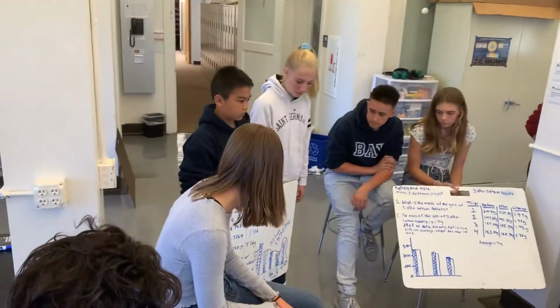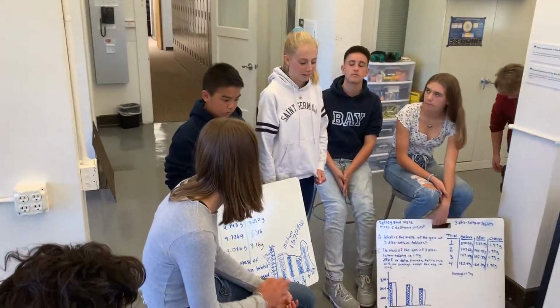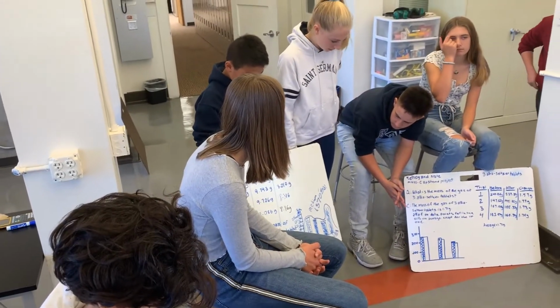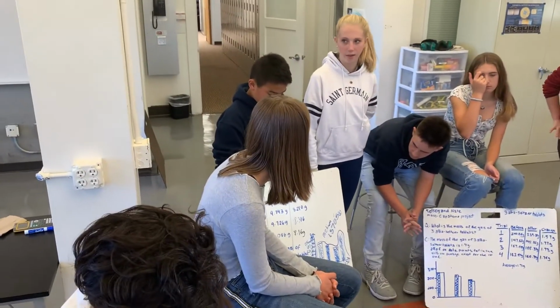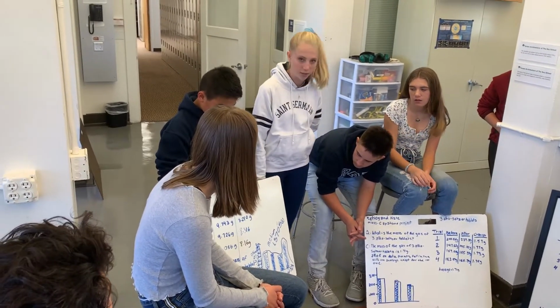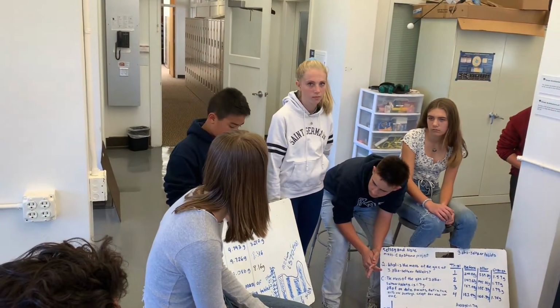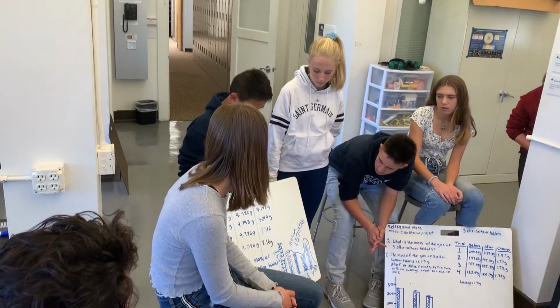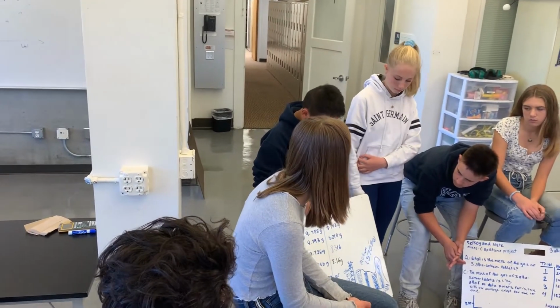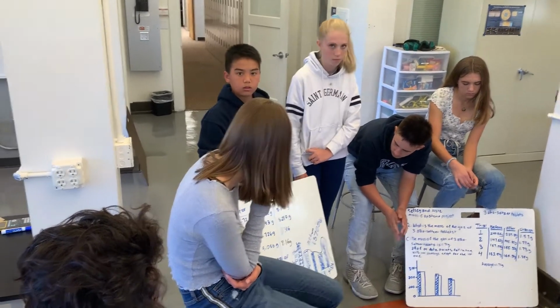So we also did 3 tablets. Originally we were going to do a different strategy with a balloon. It didn't end up going well, so we scratched that and did the regular way. We found that the average mass by 3 Alka-Seltzer tablets is 8.507 grams. We made a graph of the difference between the Alka-Seltzer and the gas mass. We came up with the median, and it was 1.5705 grams of a mass. Our tests show that the difference was near the same point.